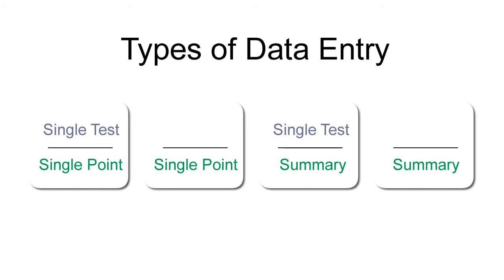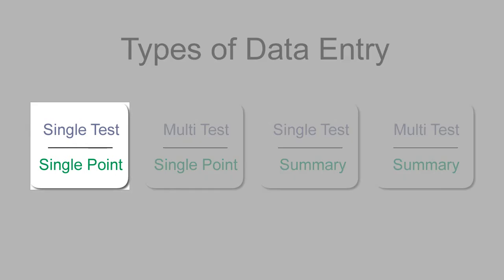Some customers prefer a faster method. This allows you to enter single point or summary data for multiple tests at the same time. Let's take a look at our first option.